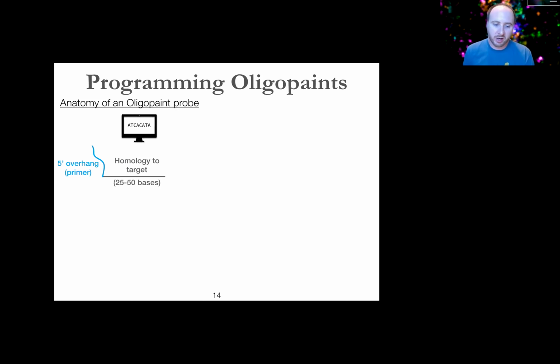And by virtue of how we make these with molecular biology, these probes often have an overhang sequence on their 5' end that comes from the PCR priming step we need to do. And you can potentially put a fluorophore right there. So it's a pretty effective way. For instance, you can buy one fluorophore-labeled primer and do PCR and apply it to many, many different oligo species instead of having to order 180,000, say, fluorophore-labeled oligos, which would be super expensive. You can order one and amplify the whole library and get it onto all of them.